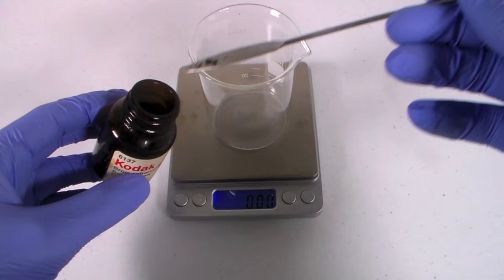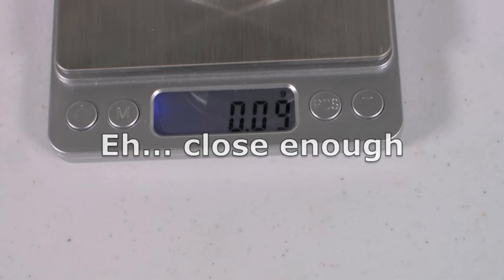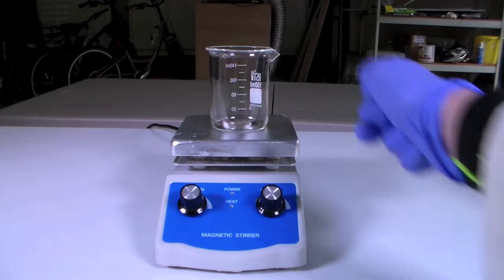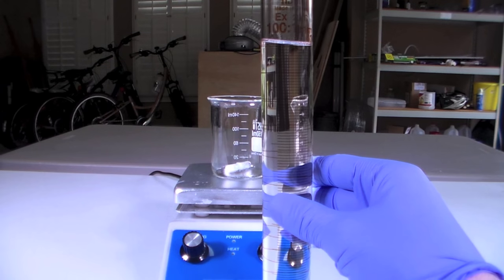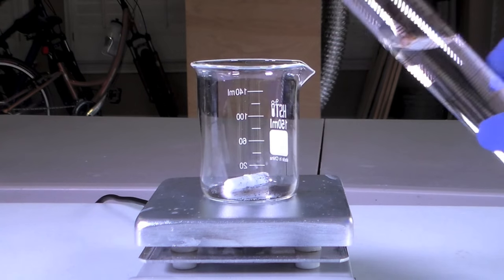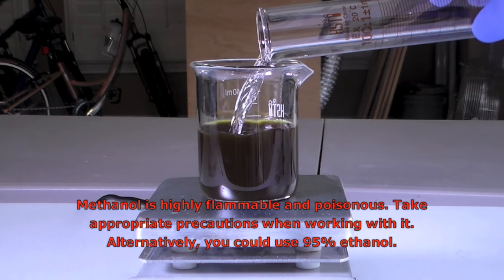Start by measuring out 0.1 grams of bromophenol blue in a beaker. Then place this beaker on a stir plate and add a magnetic stir bar. Measure out 100 milliliters of methanol and add it to the beaker. You will need to stir for a few minutes to get everything to dissolve.